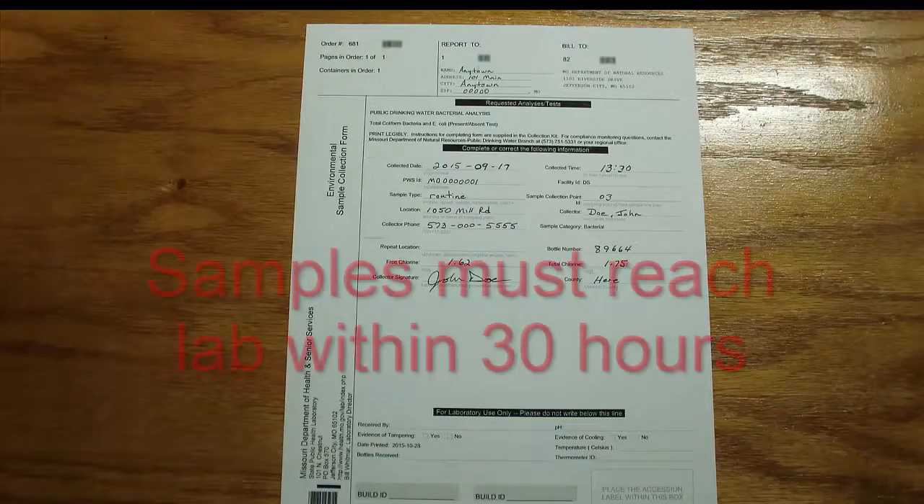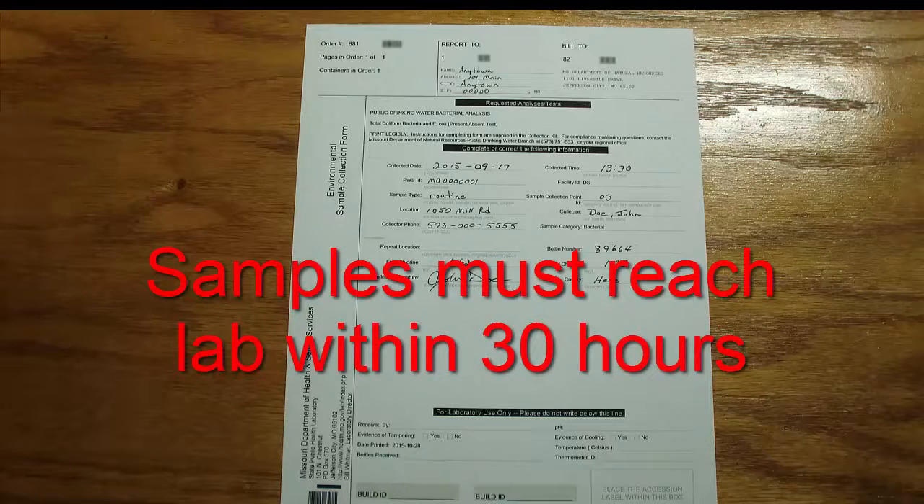All BACT samples must arrive at the lab within 30 hours from the time you have collected them. As soon as you collect your samples, send them to the lab. A free courier service pickup is available at county health departments. You can find the schedule of these pickups by contacting your county health department.